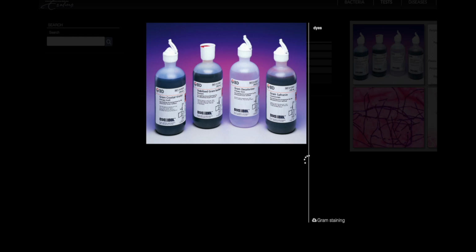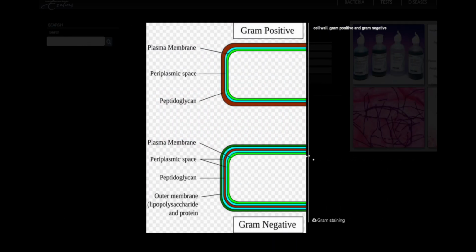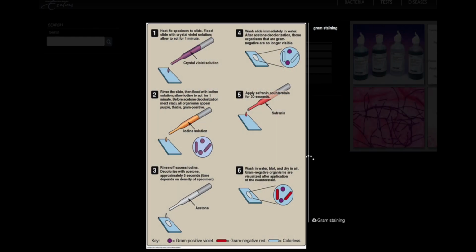Staining mechanism. Gram-positive bacteria have a thick mesh-like cell wall made of peptidoglycan, 50 to 90% of the cell envelope, and as a result are stained purple by crystal violet, whereas gram-negative bacteria have a thinner layer, 10% of the cell envelope, so do not retain the purple stain and are counterstained pink by the safranine or fuchsin. There are 4 basic steps of the Gram stain.